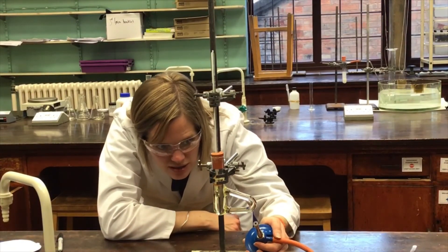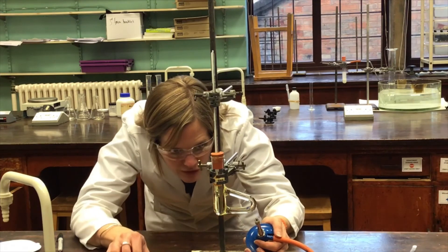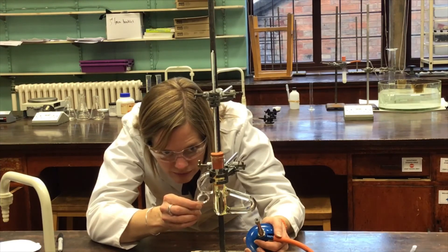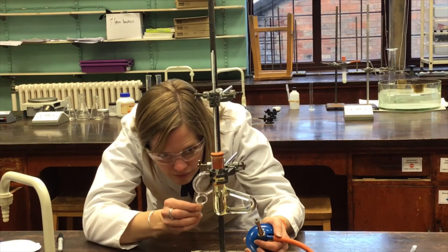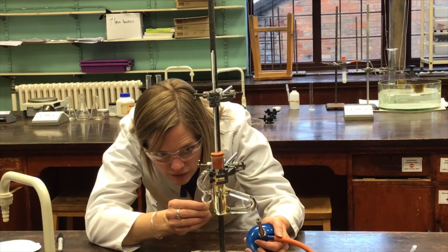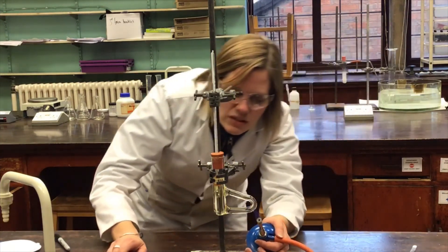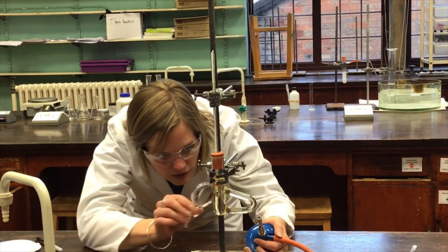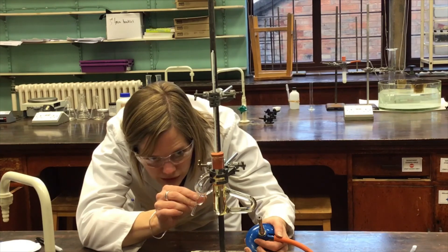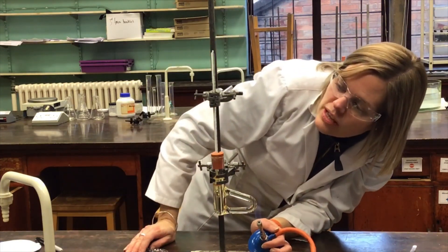We're fairly close to the expected melting point value, so I've slowed down the heating, keeping a close eye on when the first drop of liquid appears in the tube. Just now — the starting value is 137°C. I'm still watching carefully — there are still one or two crystals remaining. That seems to have gone completely now, so the ending value is 139°C.